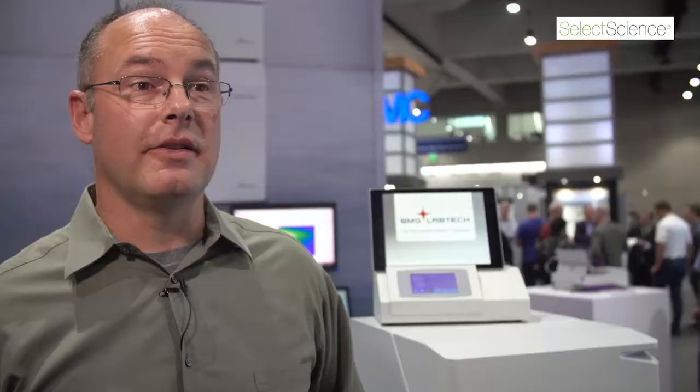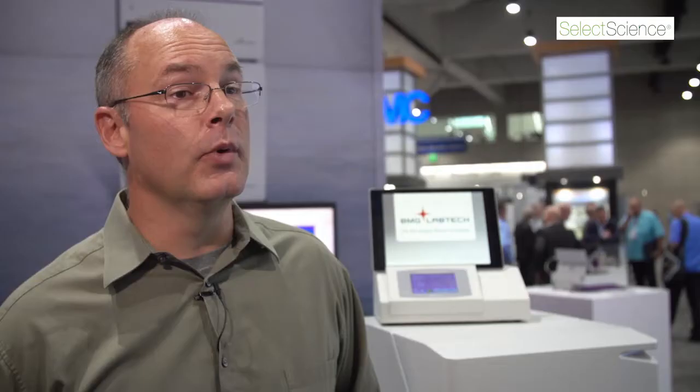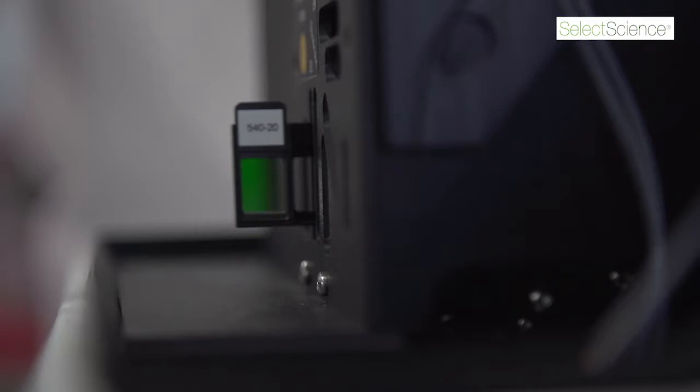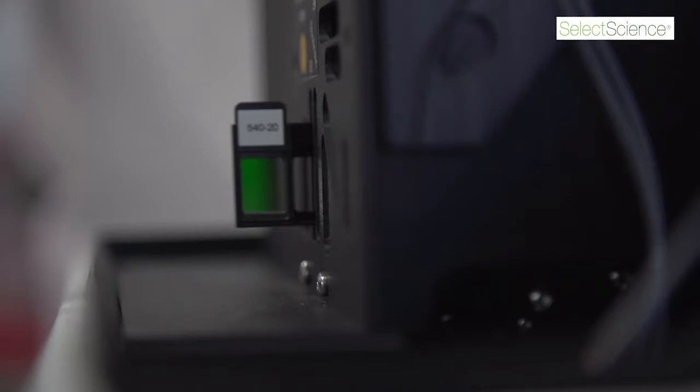The ClarioStar microplate reader is essential to all the research that we do. We prefer this machine over any other machine because it's faster, it's flexible, and we use it for absorbance readings, luminescence readings, and fluorescence readings. We use it for all three different types of assays. Just love it.